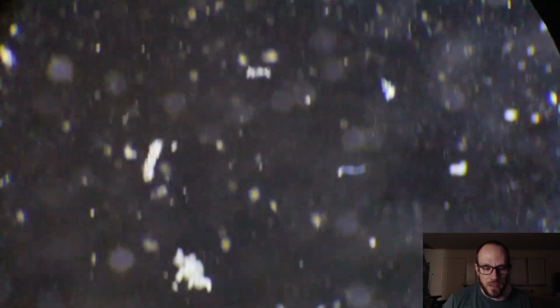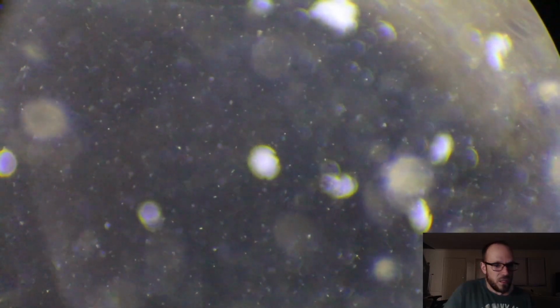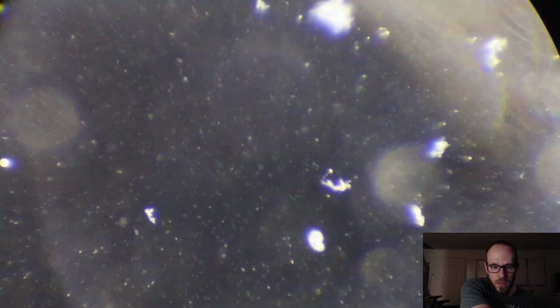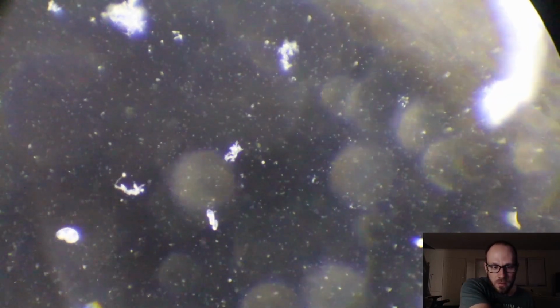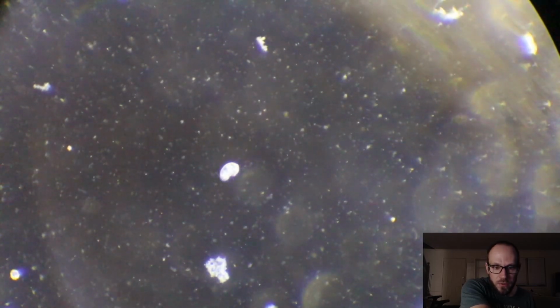I do think the next slide's going to be a lot more interesting because, oh, there's a big guy. Oh, yeah, he's one of them Parameciums. Let me get him centered up and we'll zoom in on him. Whoop, wrong way. The controls are reversed because I am using my camera. So this is being shown to you with the power of a Canon EOS RP and a 50mm lens just kind of pushed up to the microscope itself. So yeah, that there is a Paramecium.